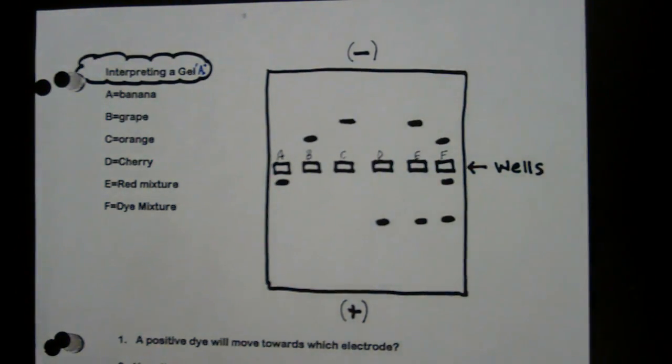And in well A, we've got banana. In B, we've got grape. C, orange. D, cherry. E is a red mixture, and F is just dye mixture.